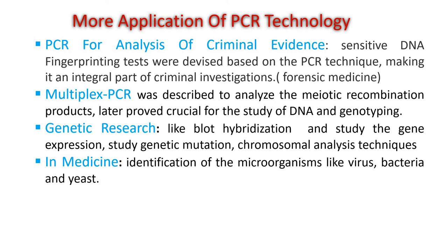المالتيبلكس PCR كتكنيك تستخدم حتى نسوي analysis of the meiotic recombination of products، ومثل ما قلنا هو studying the DNA and the genotyping مهم جدا. يعني genotype study by this multiple PCR لأنها تعرفون حضراتكم multiple samples of DNA or multiple targets نضعهم في نفس ال PCR technique experiment where we run the steps of the PCR.